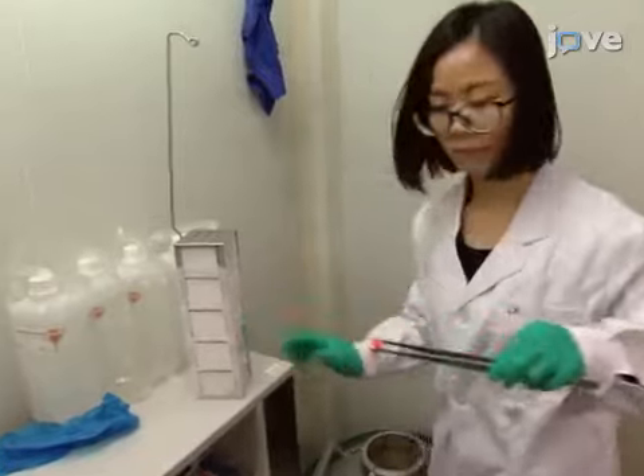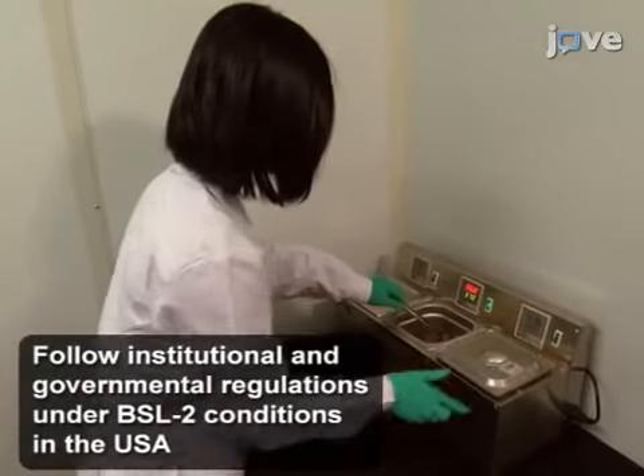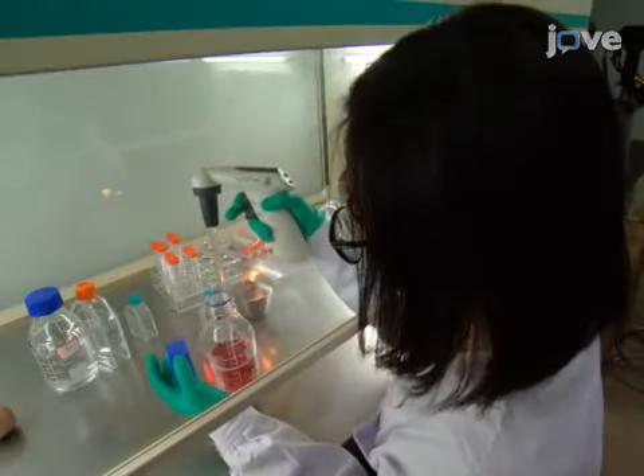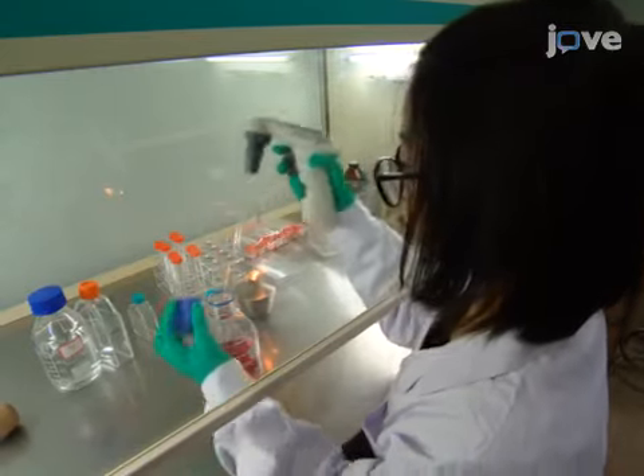To prepare EBV, on day 1, begin by thawing B95-8 cells and culture them in a T25 culture flask in 6 milliliters of complete RPMI 1640 medium.